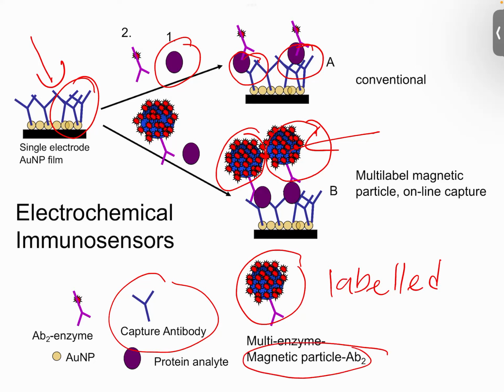So the nanoparticle will give out a signal indicating that there is an interaction between the capture antibody and the antigen, right?